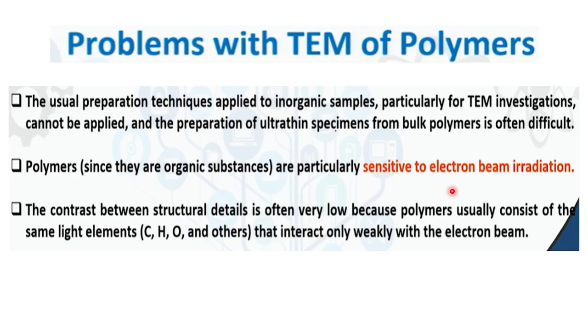So if it is only carbon, hydrogen, oxygen, it is a little bit weak. If you compare with other inorganic elements and your organic sample, the TEM image will be much brighter for heavier elemental compositions.